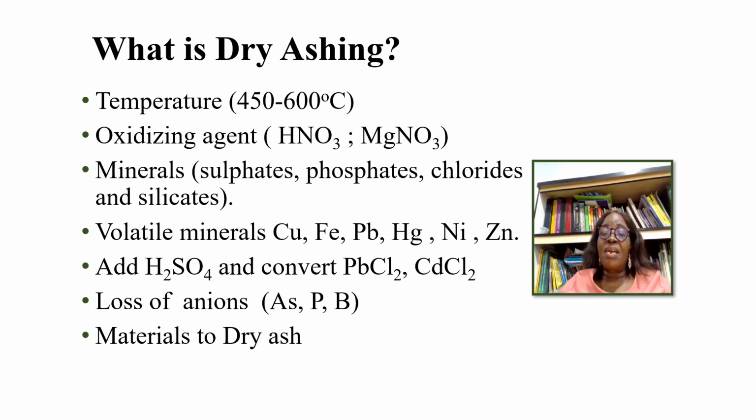It is that analytical process that the composition of a sample is determined in the dry state. The basic process is to convert the organic component into fumes and measure the weight of leftover ash. In dry ashing, water and other volatile materials are vaporized.